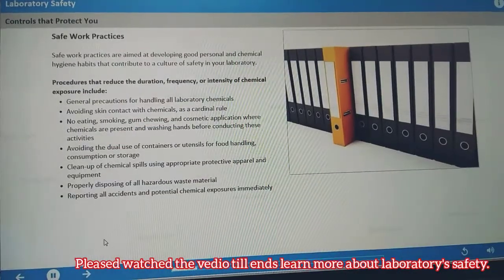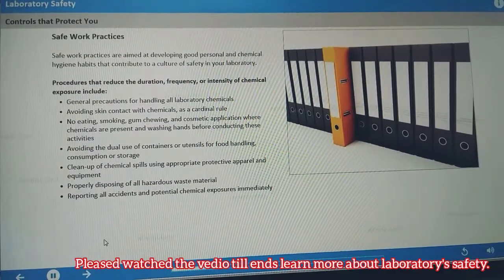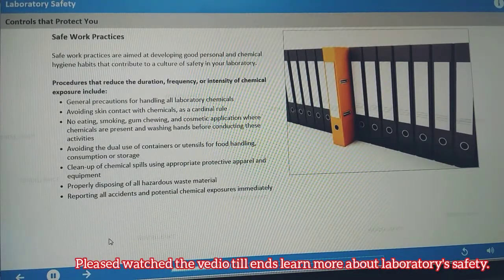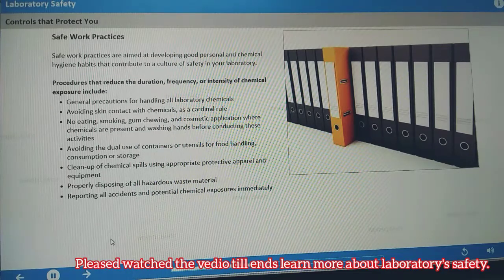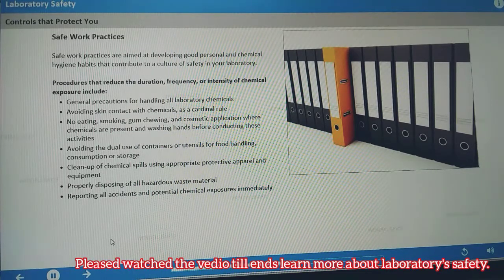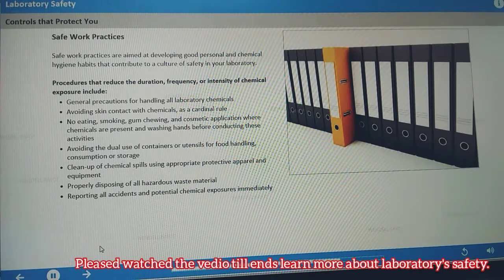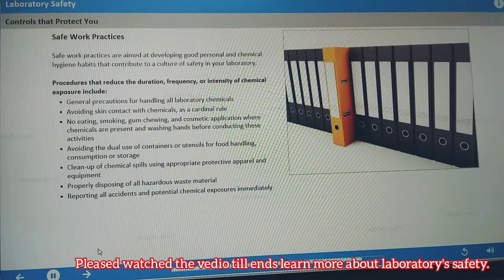Safe work practices are an administrative control, and the details for your lab should be covered in the chemical hygiene plan. Safe work practices are prudent practices aimed at reducing the duration, frequency, and intensity of chemical exposure.